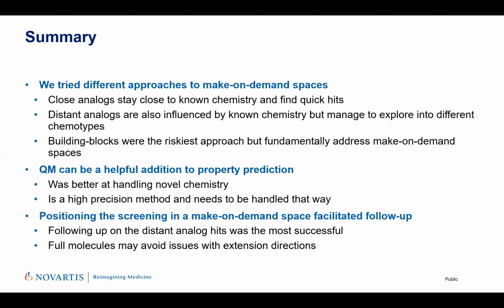Any questions about that? So if I understand correctly, you need a reporter ligand, the fluorinated one, in order to do competition assays, right? So yes, the question was whether we need a reporter ligand with a fluorine to do, and that's a little bit my question, the screening part or the Ki part, or which part? The screening. So we don't necessarily need a competitor compound with a fluorine to do the screening. Our fragments are all fluorinated, so that's the signal that we're looking at.